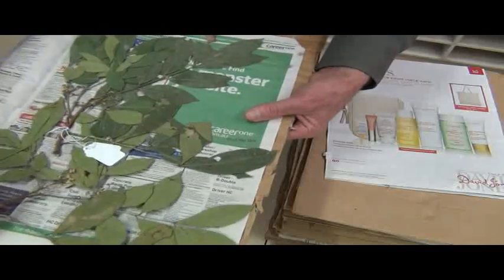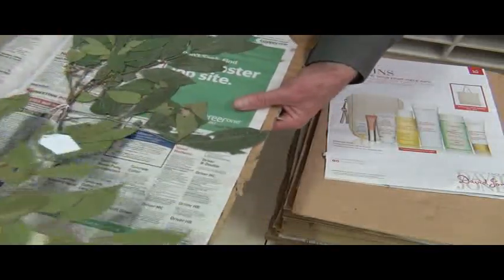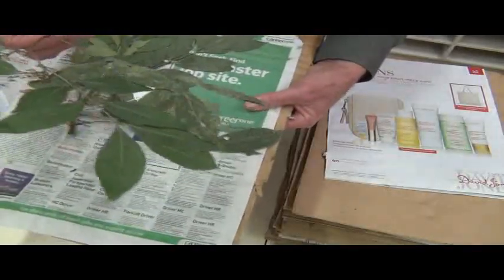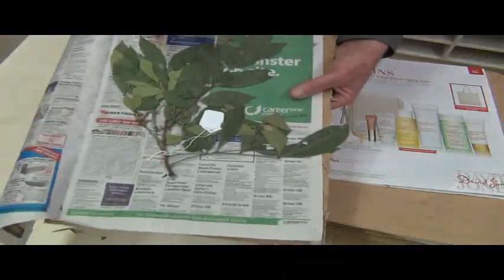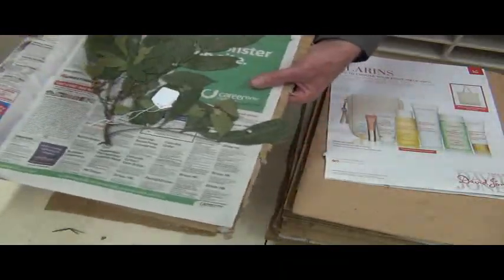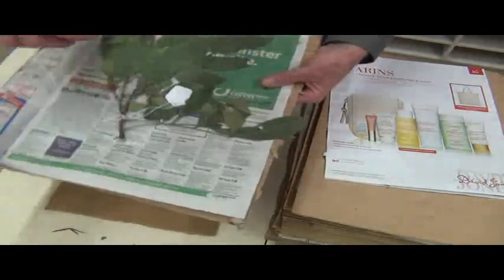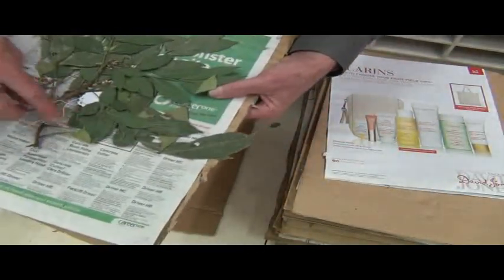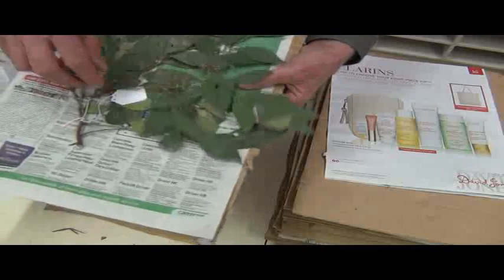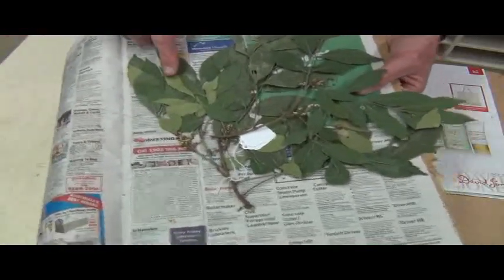This is just another of these cases where I would have just taken two sheets to do this. The material looks really good, it's got lovely flowers, there's adequate material. This bit's a bit scrunched up, whereas this other bit is nicely spread out. So you're sort of looking for — and you can see that some of these leaves are bent over, which is not so good — but on the other hand, you want to have some leaves facing up.